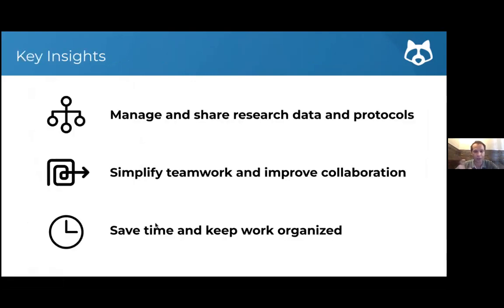And we'll talk a little bit more about some organizations. Some of you who are on this webinar might be from an organization that has a site license or a campus-wide license if it's academic. And we'll mention how to activate that premium if you are at one of those institutions.